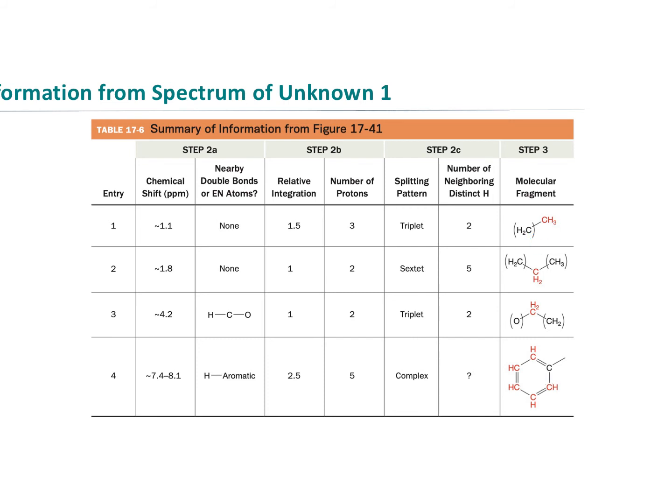So there's that CH3, CH2. There's a CH2 in between, probably a CH3 and a CH2. And then here's another CH2. And then there's probably an oxygen attached. It's one of the reasons why that's so downfield, and we get this 4.2 there. That's pretty far down. And then an aromatic ring.